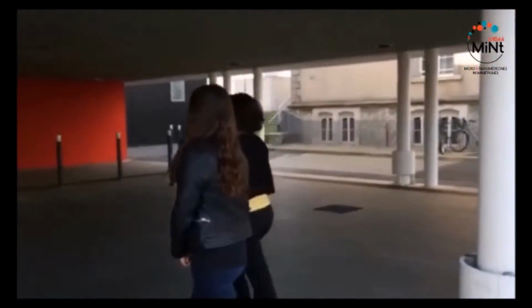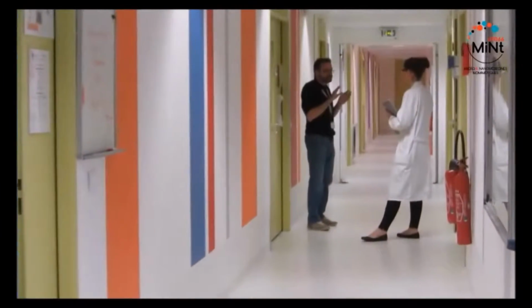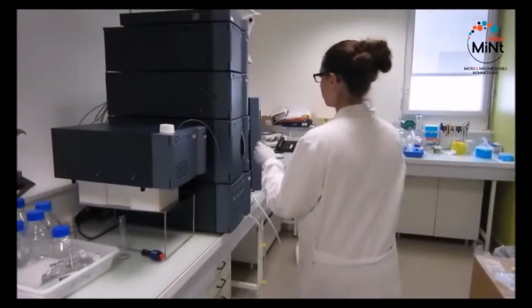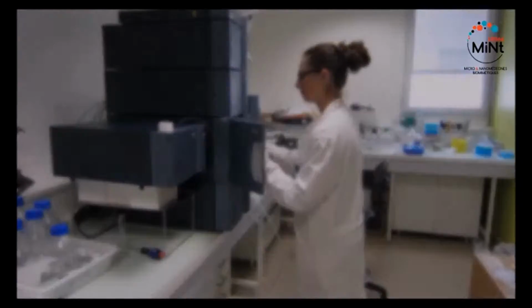Come inside and have a look on the Transint project in the Mint Lab. The Mint Lab has developed two prototypes, polymetallic nanocomplexes and aqueous core nanocapsules. We are also developing a method to assess mucodiffusion using fluorescence microscopy.